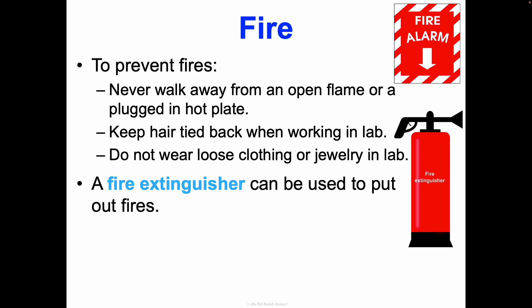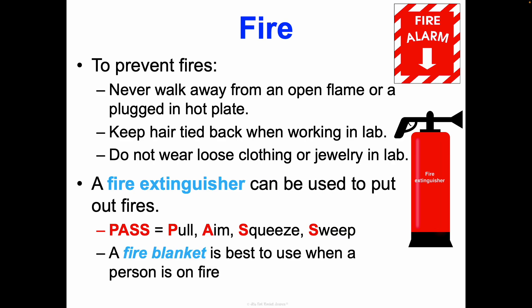If a fire does happen, a fire extinguisher can be used to put out fires. Look around your classroom now and see where one is located. How you use a fire extinguisher follows the acronym PASS: Pull the notch at the top to unlock it, Aim it at the fire, Squeeze the handle, and Sweep in a motion to cover the flame. If possible, I prefer to use a fire blanket, especially if a person is on fire, because then you're not getting sprayed with chemicals. You can literally throw the fire blanket on top of someone or on top of a small fire and stomp it out.